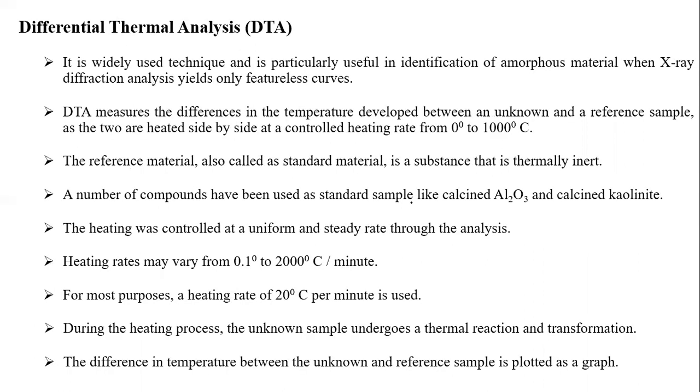So these are thermal properties. Now coming to our original theme, differential thermal analysis. This type of analysis is very useful for both crystalline and amorphous material, which is very important. We can even identify the amorphous material in this type of analysis, which is not possible in X-ray diffraction analysis. Here, we put our unknown sample in the instrument, along with the reference sample.